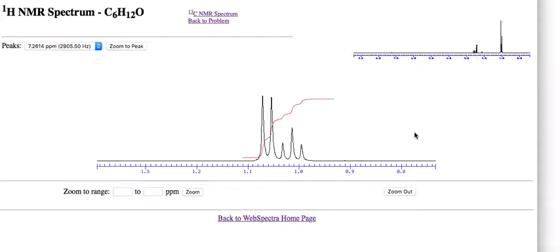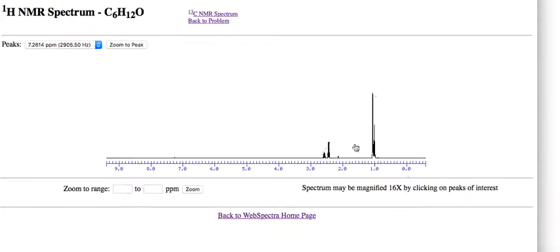Now, in addition, these 2 peaks over here, the 1 and the 2, those are shifted downfield. Those are going to be closer to whatever the interesting bit of this molecule is, which is going to involve the O. And these back here are further away, further isolated from the O and its section. So what I'm going to propose we have: the signatures that we have here with the 1 and 6 are a good signature for an isopropyl group. And then the 2 and the 3 are a good signature for an ethyl group. I'm going to show you those pictures in just a second.